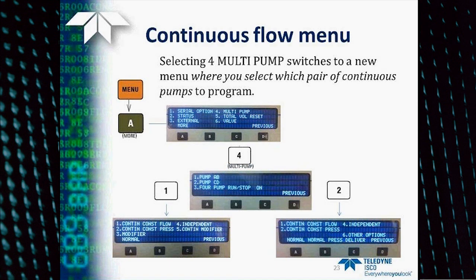Also, you'll notice here that for the second pair, you're limited in a couple of modes that you cannot use with the second pair of pumps. These are the modifier and the continuous modifier modes, which are not available for the second pair.